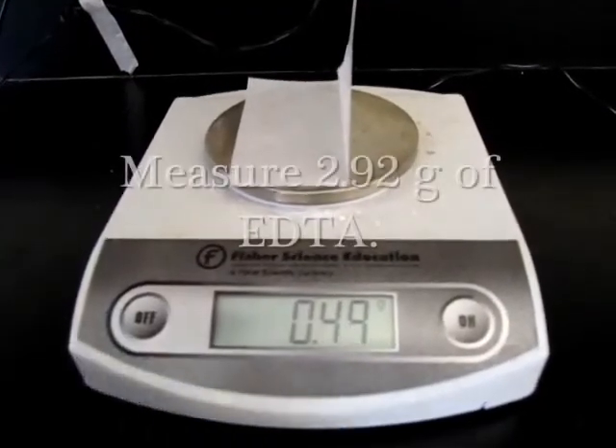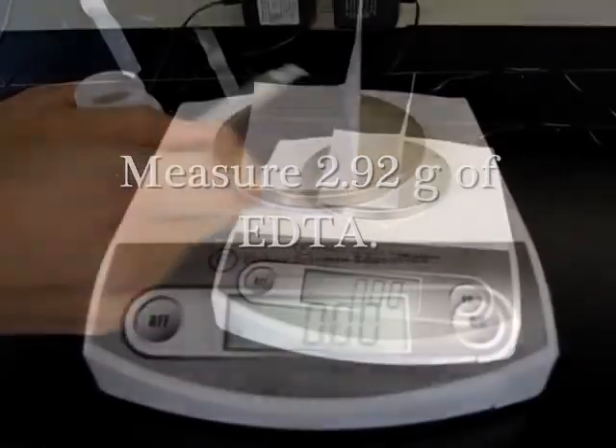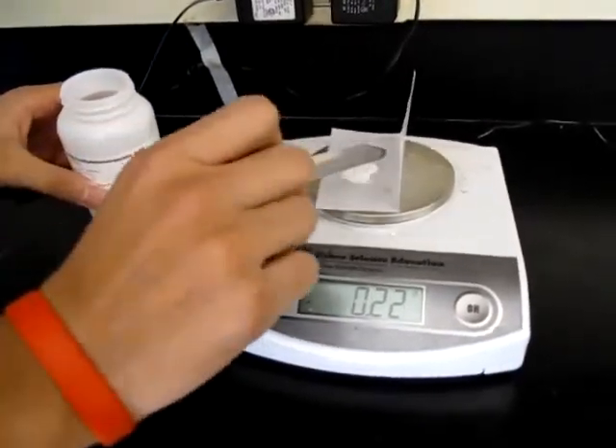Before weighing the EDTA, make sure to tare the balance. Then, mass out 2.92 grams of EDTA.